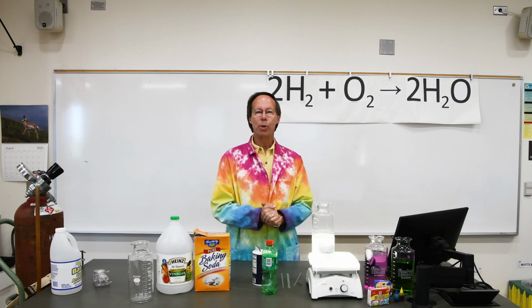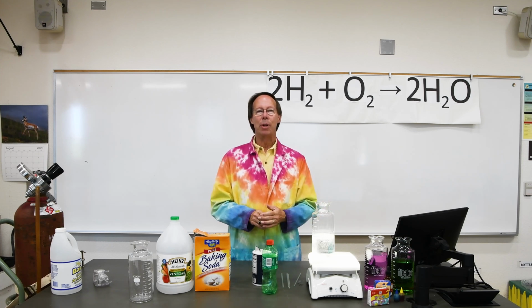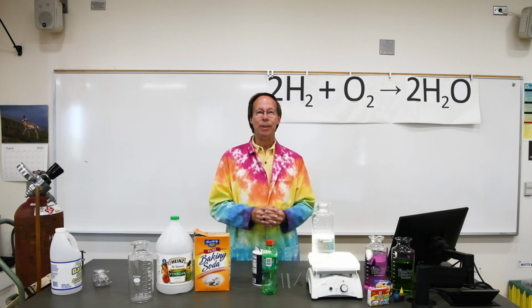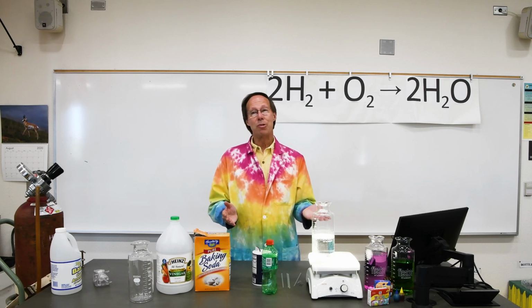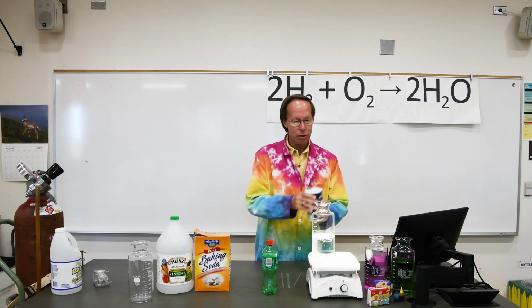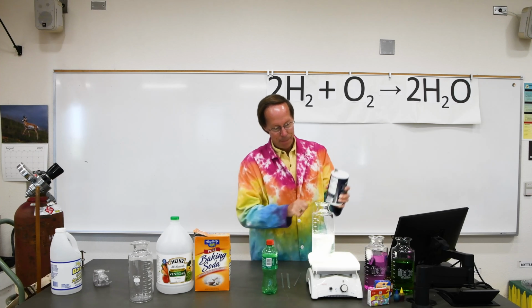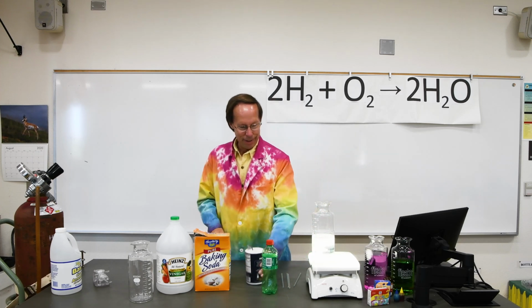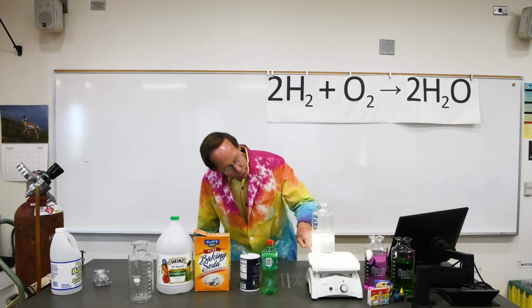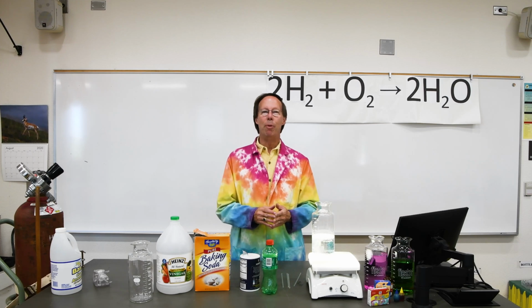We learned earlier in the semester that the formation of a gas indicates a chemical reaction. But did a chemical reaction actually take place here? Answer in this case is no, because the gas you're seeing is carbon dioxide. We can add some more salt to it, and it bubbles again. And although it's not obvious to you guys from a distance, there's still a pile of salt sitting on the bottom, but the salt is no longer making it bubble.